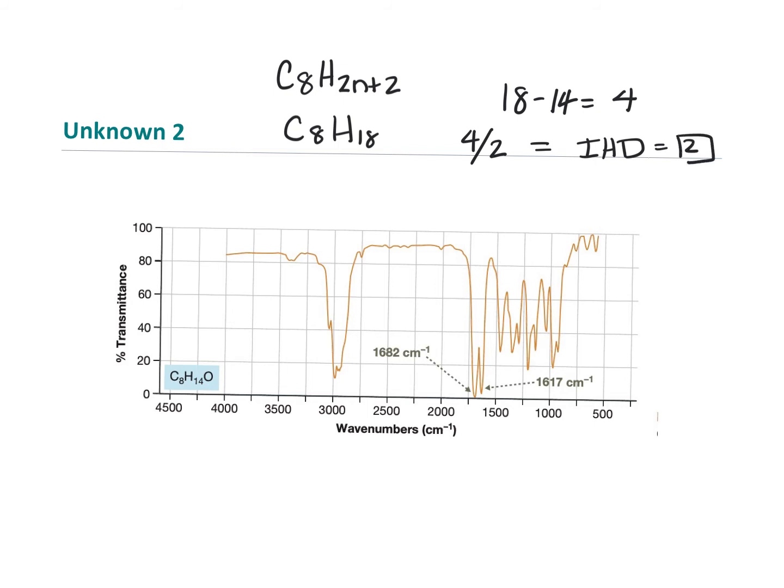And so here's some things that tells us. No benzene. Right? And what you don't know is just as helpful as what you do know. I can look at this and say there's no alcohol, right? And that's also really helpful here because we don't have the big stretch here. So we can also look at this immediately out of the gate and say there is no alcohol group there.